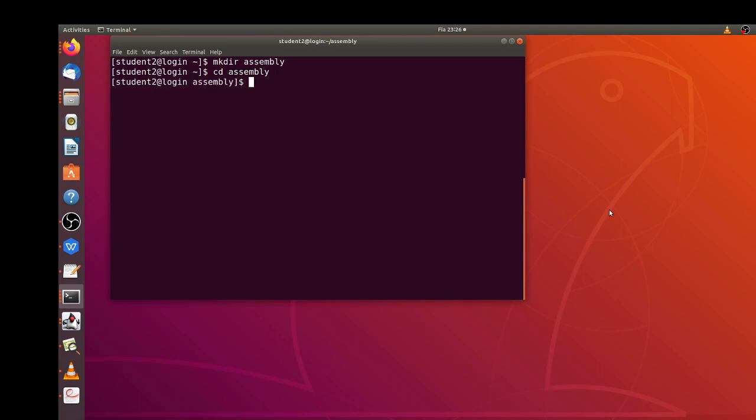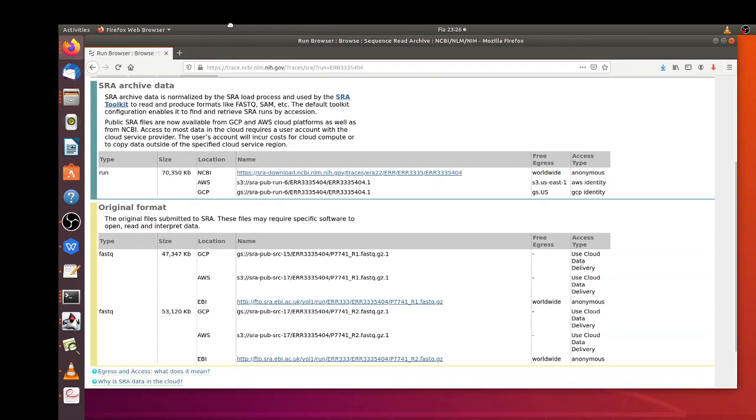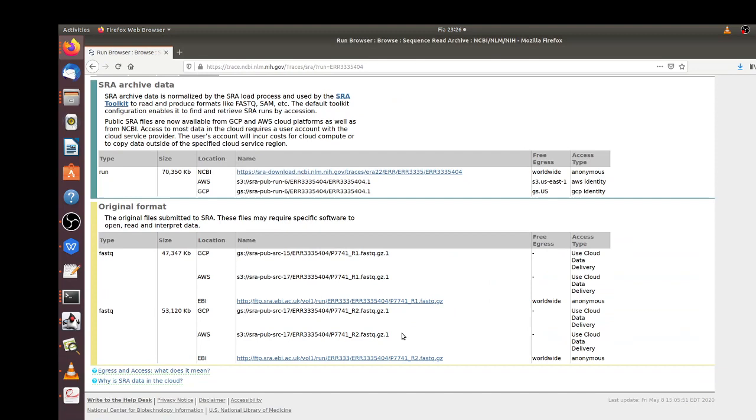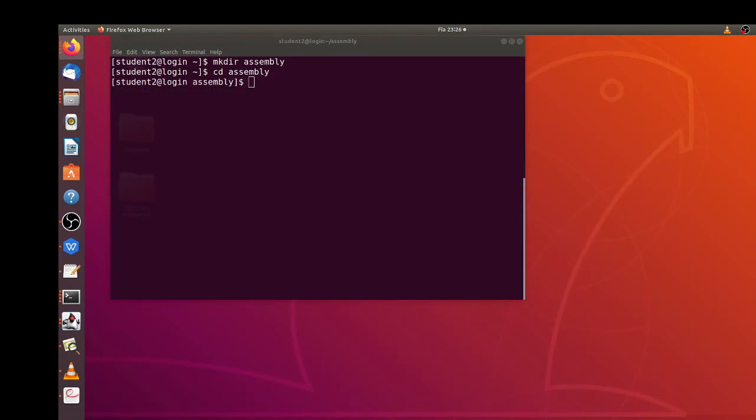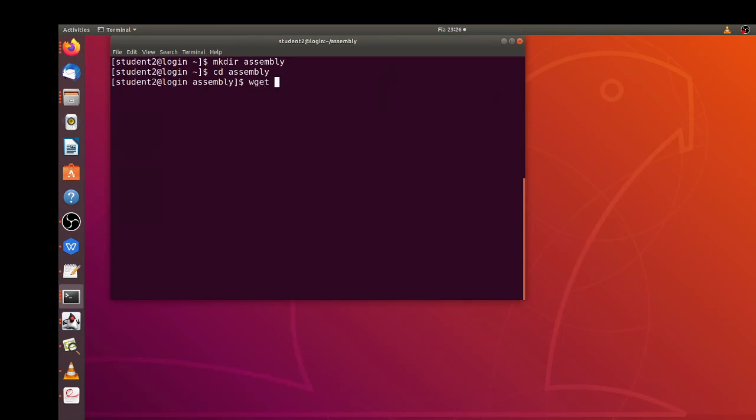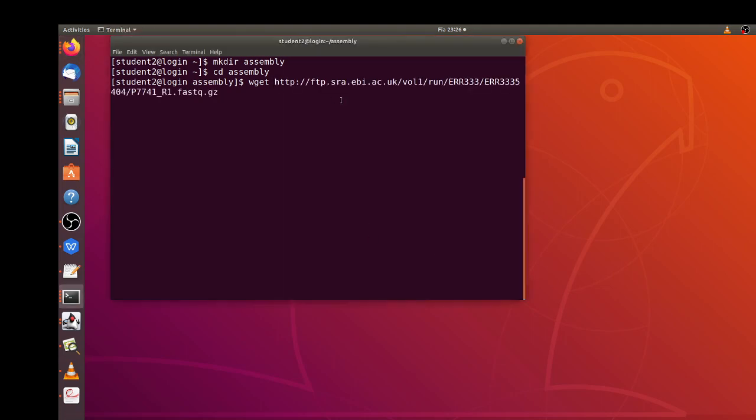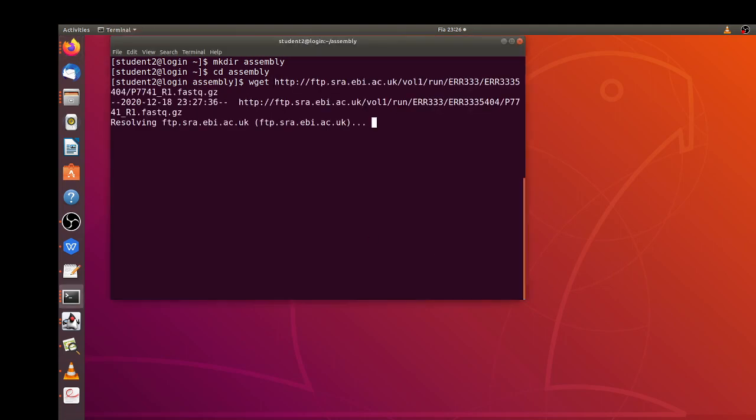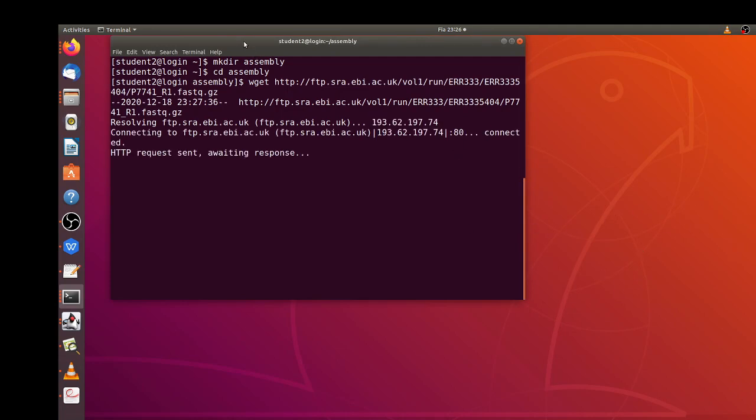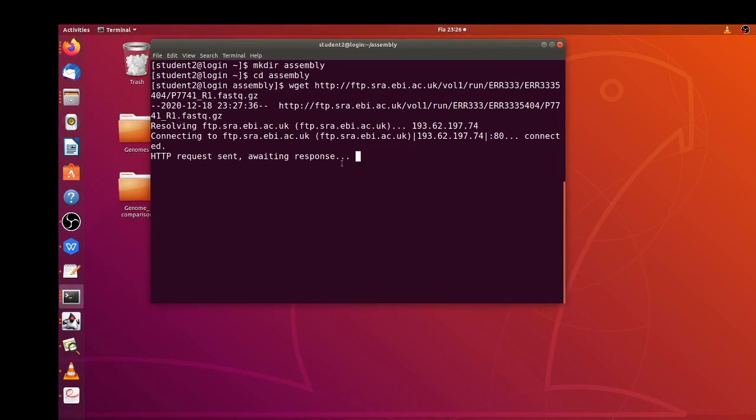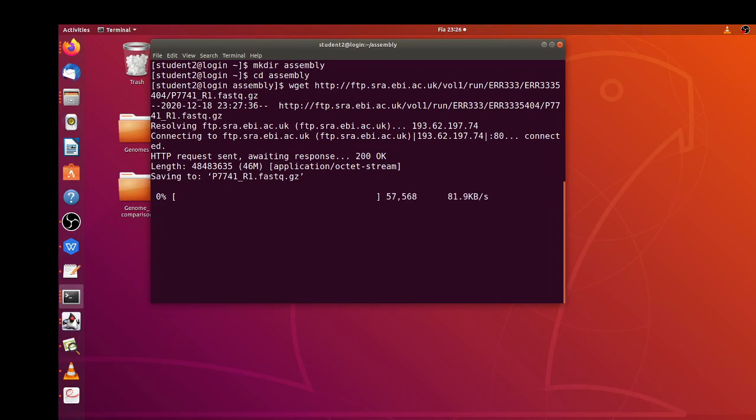Then I'll download the datasets and I have the download links which are here. I'm going to use wget to download the two datasets, so I have my wget command and then I add the download link for read one. It starts downloading.